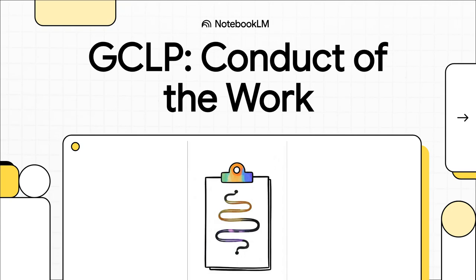All right, welcome to our explainer on Good Clinical Laboratory Practice, or GCLP. Today we're jumping right into Chapter 5, the conduct of the work. And let's be clear, this isn't just about reading rules from a book. This is about what happens in the lab, second by second, where every single action directly impacts the safety of patients and the integrity of a clinical trial.